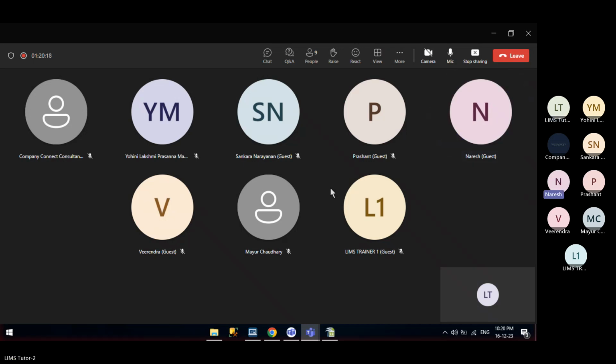Yeah. See, all things are done in the LIMS application only, from static data creation to COA release. All the things happen in the electronic data of the LIMS. So why don't we do the investigation cycles in LIMS itself? It will be electronic data, totally in one application, and easy to track.